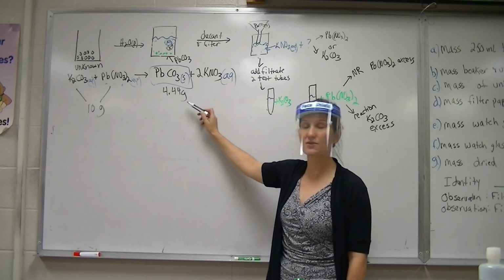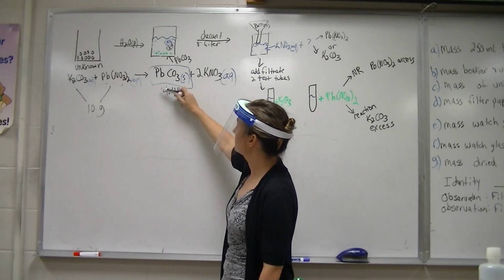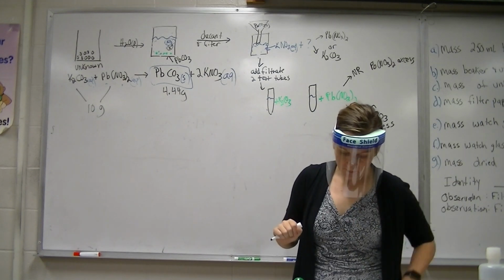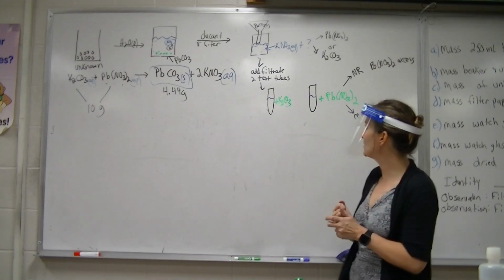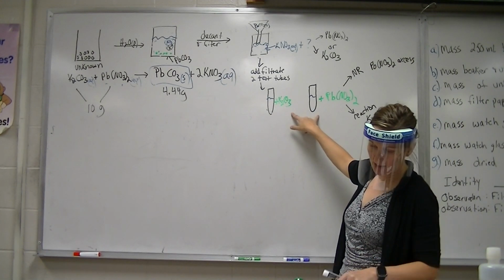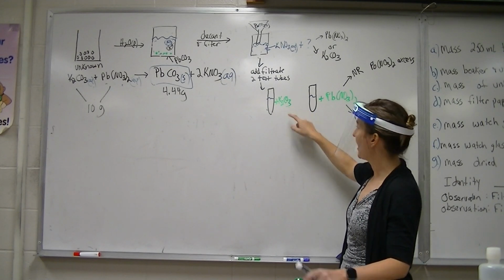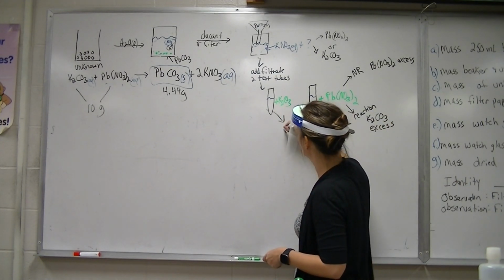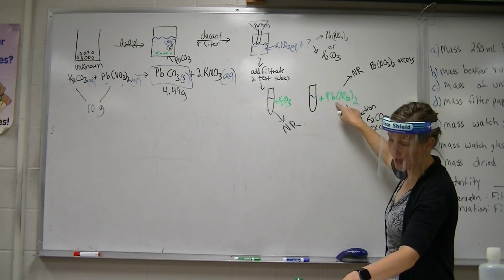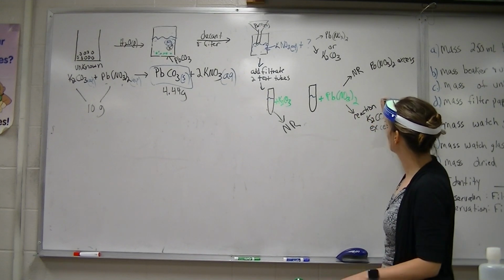So it's the same steps. You're going to get your initial mass of your mixture. Once you're done and isolate the solid, you'll get the mass of that as well. So these are their results. Now they noticed that when they took their filtrate, so they had their 2 test tubes with their filtrate, the one that they reacted with K2CO3 had no reaction. The one that they reacted with lead 2 nitrate, they did see a reaction. So it's this one.